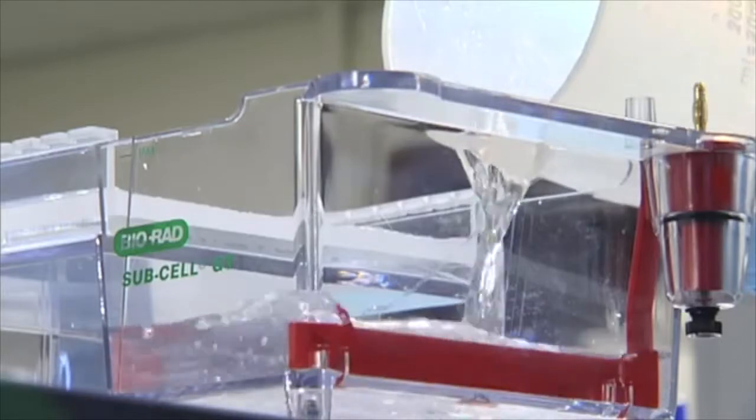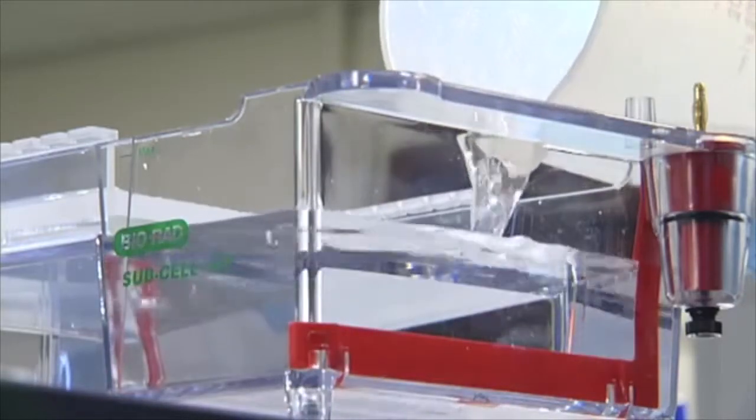Most electrophoresis chambers are charged by running constantly at 150 volts. Depending on the substances that were inserted into the wells, the charge will flow through the gel from the negative side to the positive side.